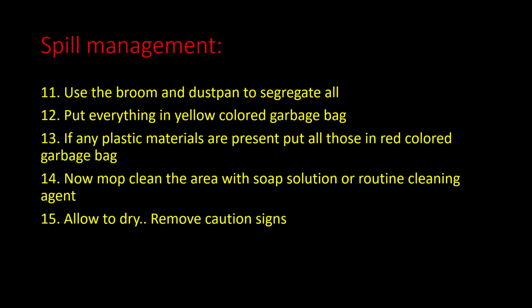the dustpan and then put it into a yellow colored garbage bag. And then if any plastic material or broken glass material is there: if plastic material is there, you have to put it into a red color garbage bag. If broken glasses are there, then you have to put them into the blue color bag. So depending upon what material is present, you also have to take care of that.